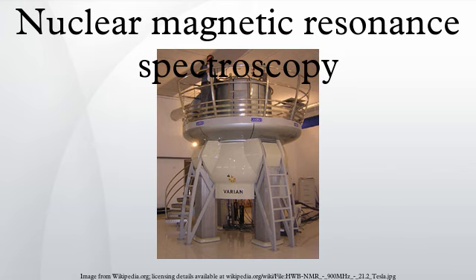Vespa. Vespa is a free software suite composed of 3 Python applications. These GUI-based tools are for magnetic resonance spectral simulation, RF pulse design, and spectral processing and analysis of MR data.